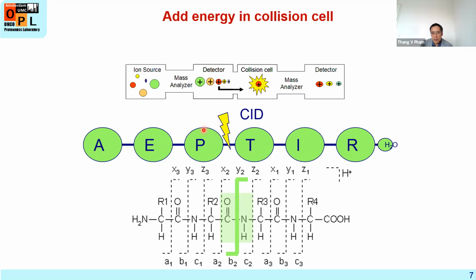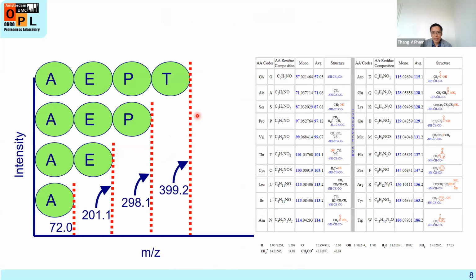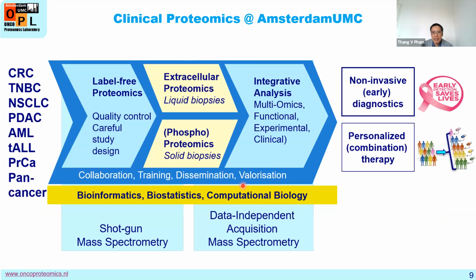The mass spectrometry will measure the mass of each ion. In this figure, you see that by having the mass of each of these broken smaller pieces and matching to a theoretical mass, a computer algorithm will identify which one is which. So it's quite a lot of bioinformatics before you can get down to machine learning.